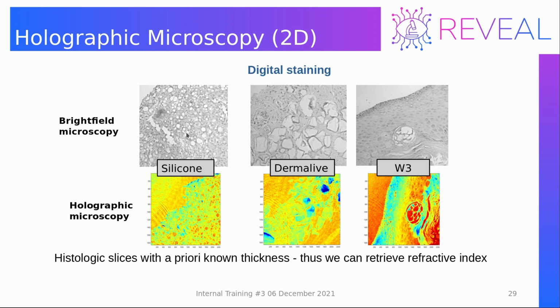There were patients who were given dermal fillers, which are substances that you get injected under the skin to remove wrinkles. After some time, some of the patients had problems with their skin, and they didn't know which dermal filler they were given. So we were given this task.